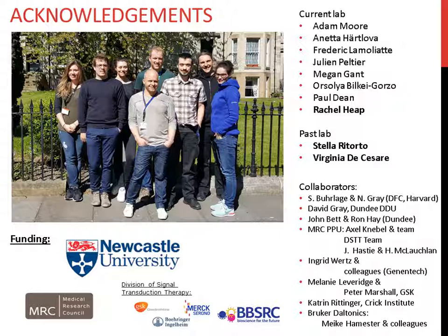I hope I understand the question right. Of course, if your matrix is exactly at the same mass as the product or substrate, then you might get into a bit of a problem. But again, the newer MALDIs have such a high resolution that we are actually able to distinguish many of these ions quite significantly.